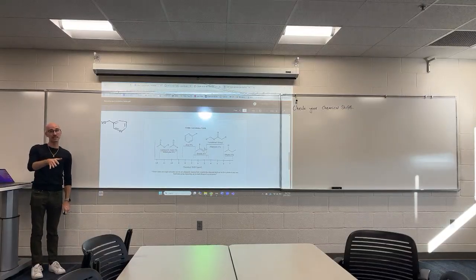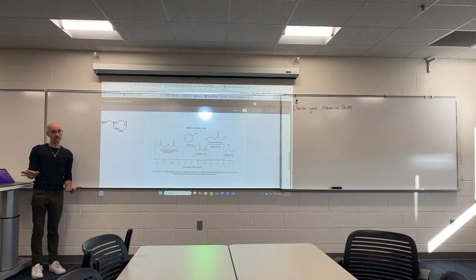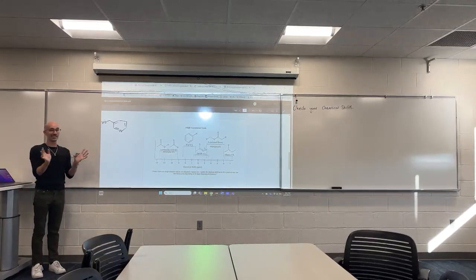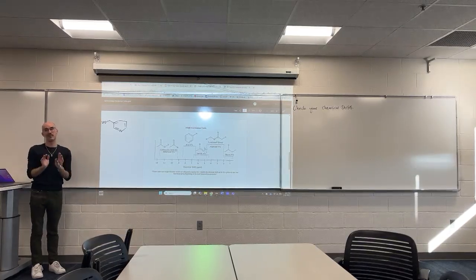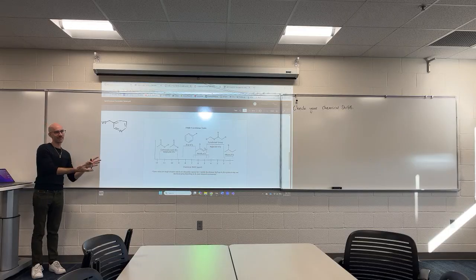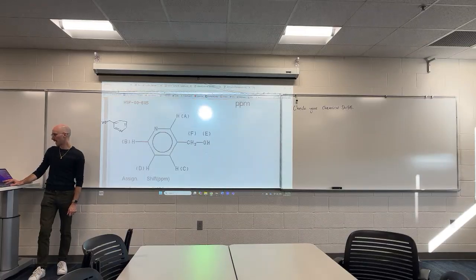That's the problem with these correlation tables. There is this intrinsic hand waviness to it. Oh, the signal didn't show up exactly where you thought it would based on these dotted lines. That's okay. It's not meant to be hard cutoffs, but like, you know how we say orbitals are 95% probability region? This is like the 95% probability region of where you're going to find that signal. So let's look back at its spectrum.